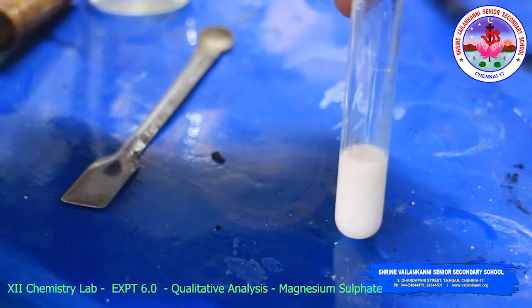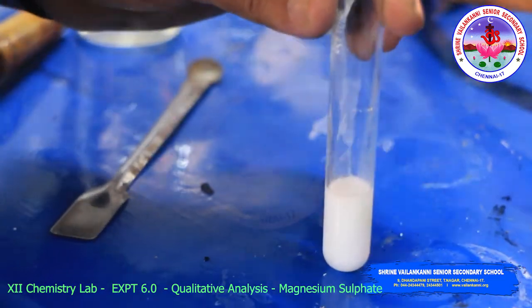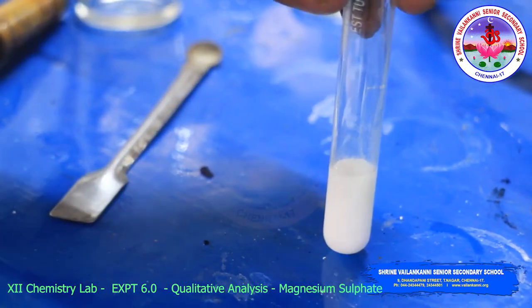A white precipitate is obtained. So this indicates sulphate is confirmed.